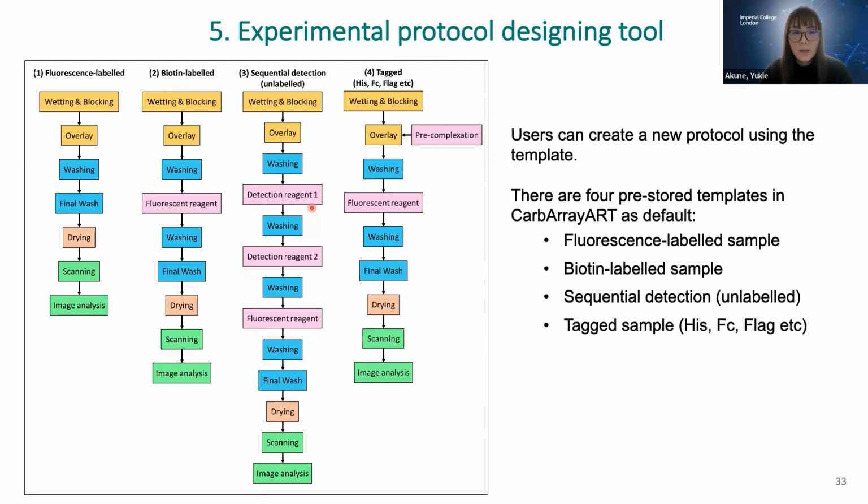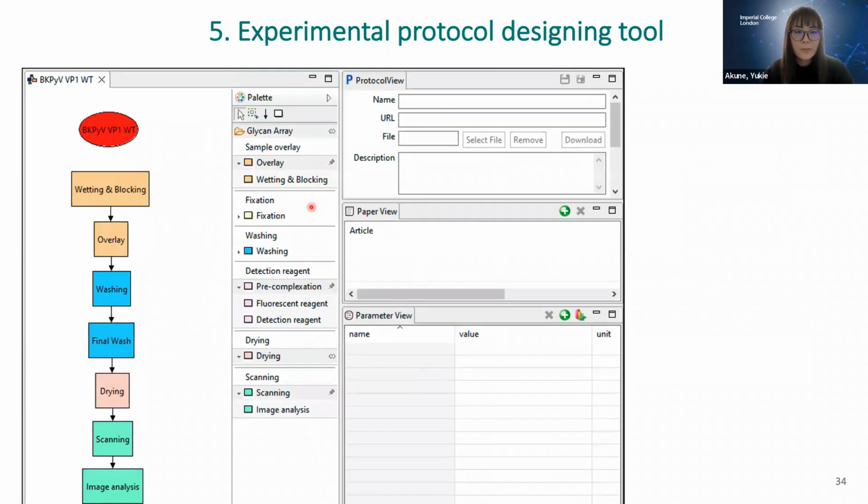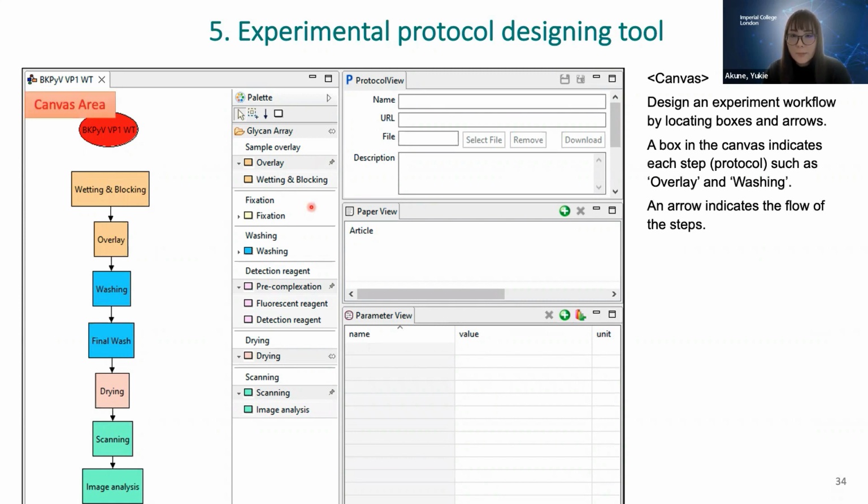But then after selecting the templates in this example, it comes to the designing tool page. It has the canvas area. So this is the protocol created in here.